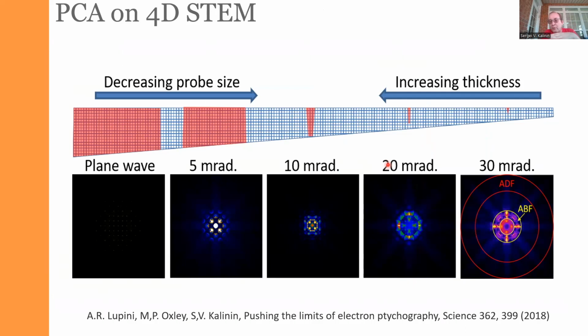Okay, the final thing that I want to briefly mention is whether we can apply this type of transformation to more complex datasets. One of the things that people are very excited about now in electron microscopy is 4D STEM. Gerd is going to talk more about it. Basically, this is the technique where we focus our beam to a subatomic diameter, and then we get the Fourier transform, and then we get the diffraction. It's a very unusual diffraction because in this case, the width of the peaks is much larger than the spacing of the peaks. So our data looks like overlapping disks.